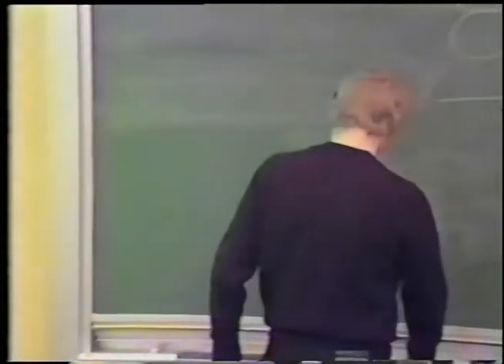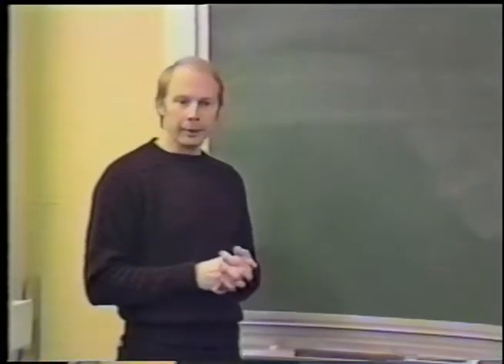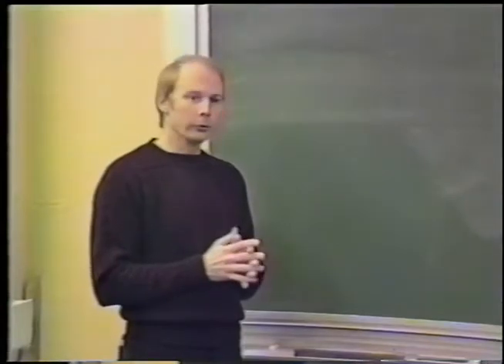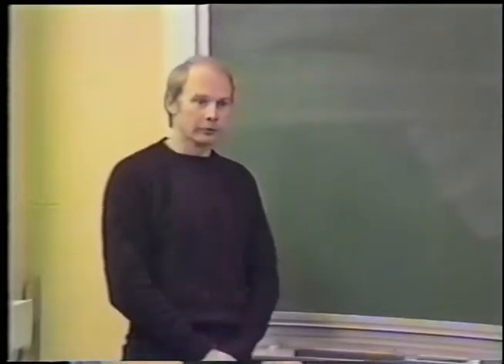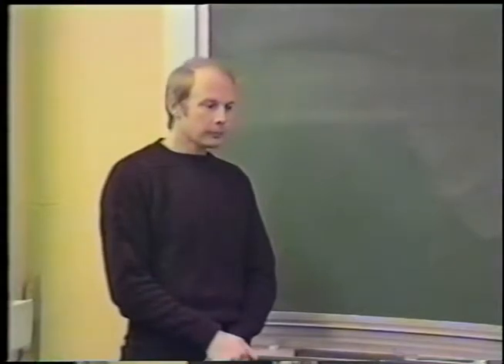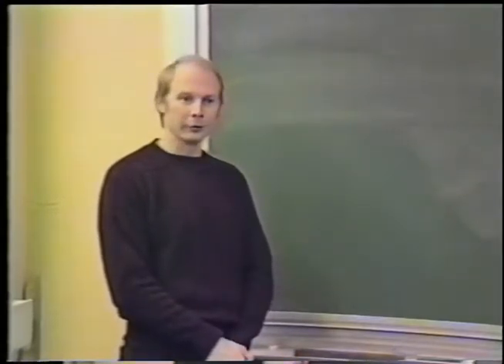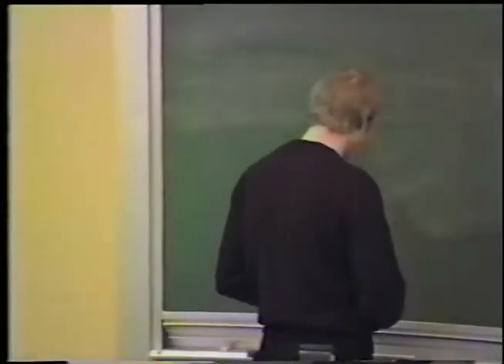Okay? So if you're going to do work that is very demanding, very critical, where you have to have the utmost in resolution, then you would probably want to go to a helium system to take advantage of the slight decrease in average ice crystal size that you would get. It may not show up in the morphology that you can see in a micrograph. It may show up, say, in an X-ray diffraction pattern or something like that. But it will be there. And I have some slides of some modern devices.